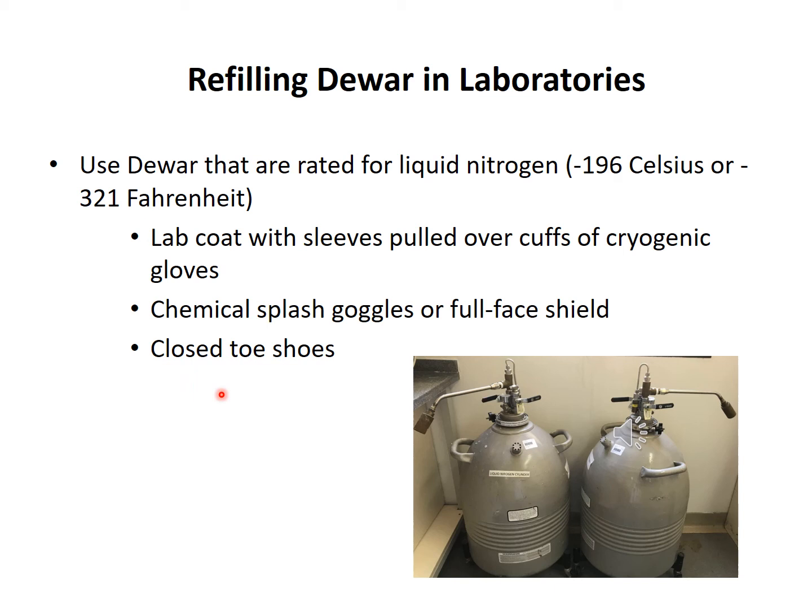And your shoes, you cannot compromise. There is a 100% chance that even one or two drops will go outside, even when you are very careful. It can spill onto your shoes, so your shoes should be closed-toe shoes, otherwise it can burn your skin.